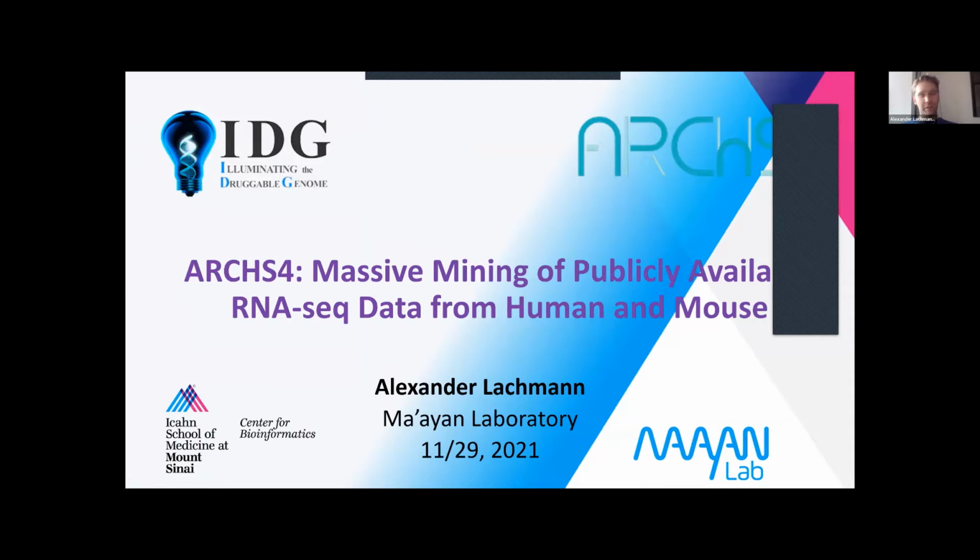About ARCHS4, and then I do some slides, and then I go to the website and show it live.